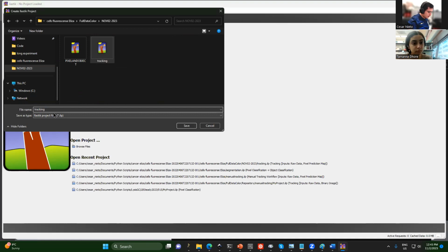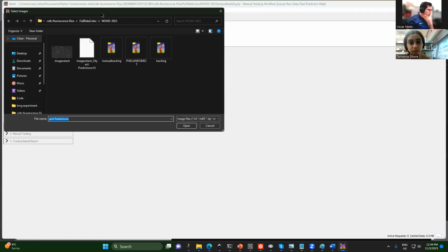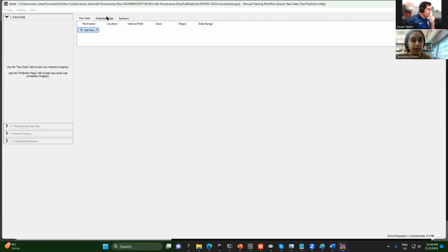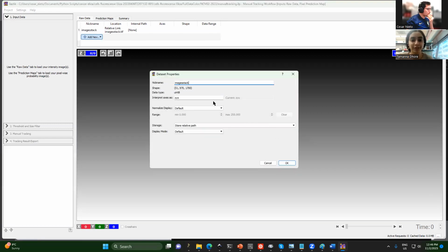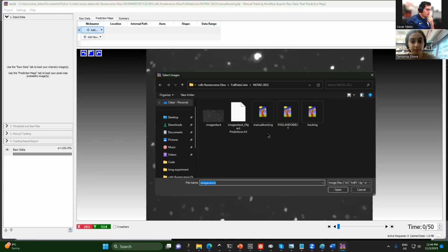Do you have training on these kind of things? Because when I did my PhD, it was like 5 years ago, and at that time maybe the tracking and neural networks weren't that developed. I haven't had training on it yet. I'm just starting out. This is my first year, so. Okay. Yeah, because this is like the thing we did 3 or 4 years ago, so I'm not sure if now we have something better.